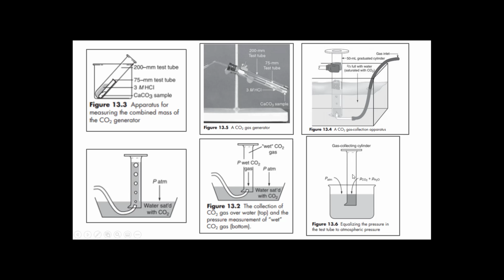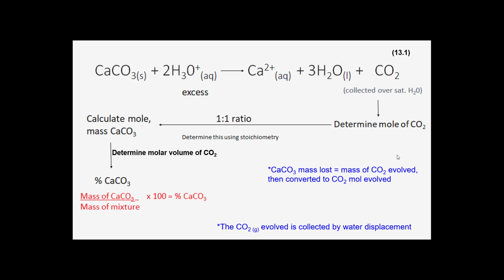You have to stick your hand in this large tube. There's another graduated cylinder you move this to, and you get your arm wet all the way up to your elbow. It's really fun for some students. You can ask them. So this is my words to explain this lab. Again, you definitely should read this lab over to make sure that you completely understand, but this is a good preview to explain how this lab goes.